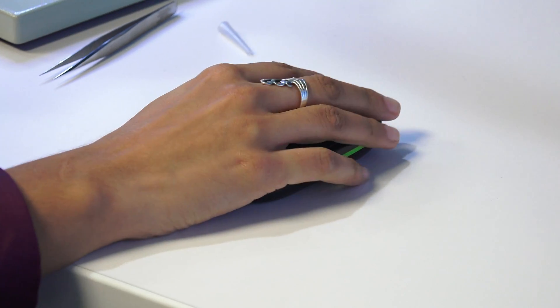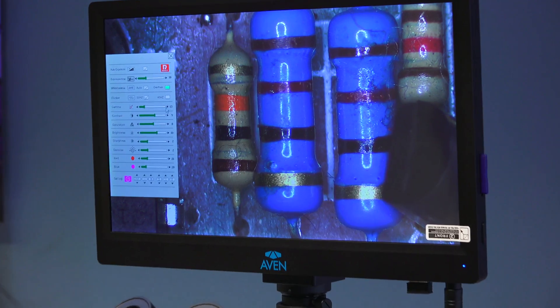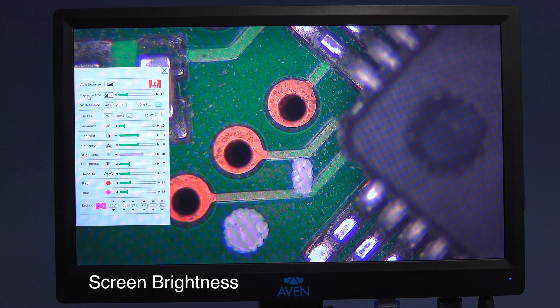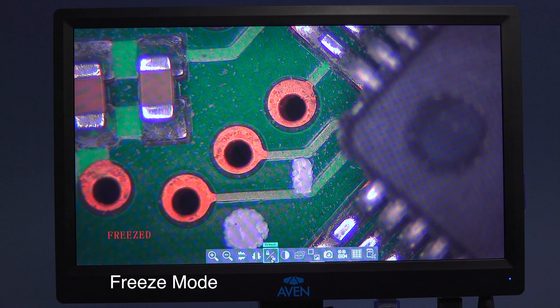Using the included wireless mouse, MightyCam Eidos permits users to control on-screen features such as digital zoom, grid overlays, image sharpness, screen brightness, white balance, as well as compare, freeze and mirror modes.